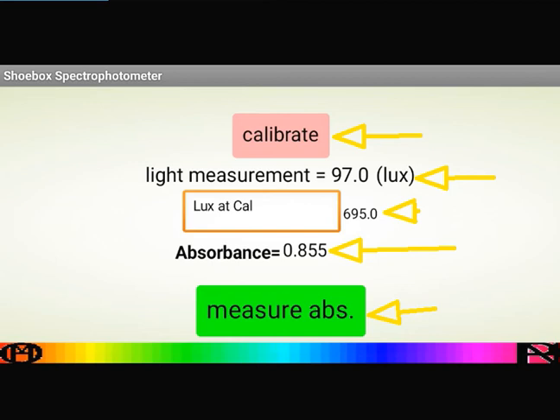How well it will work will depend on your light source and also the hardware in your phone, the light sensor that you've got. But it's worth playing around with.